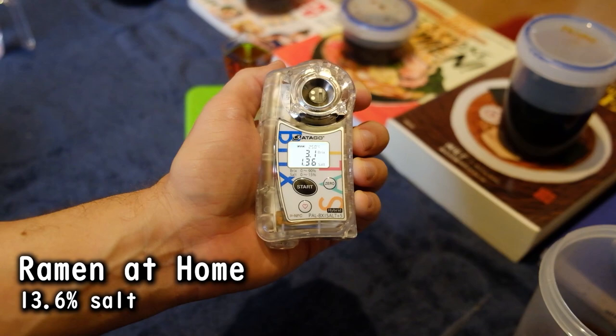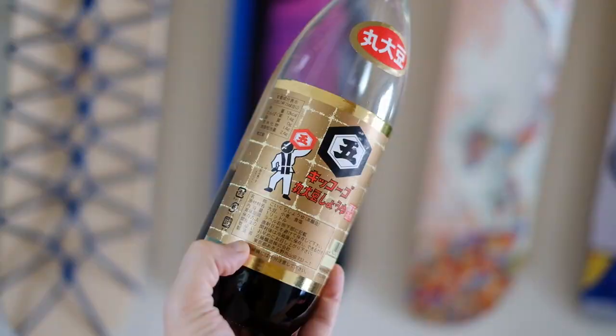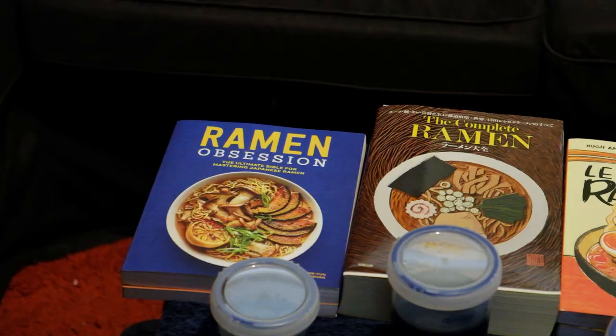Multiply this by 10 and you get the actual number: 13.6% salt solution. For reference, straight soy sauce is around 15–18% salt.